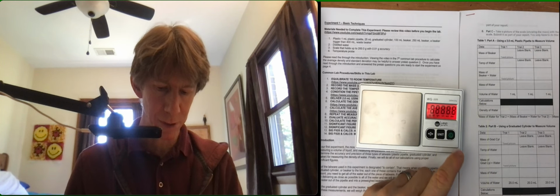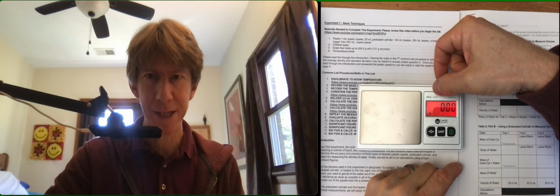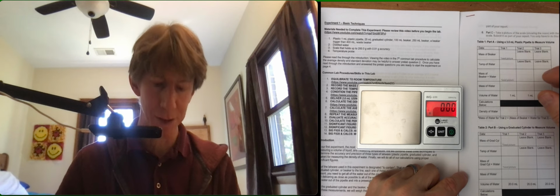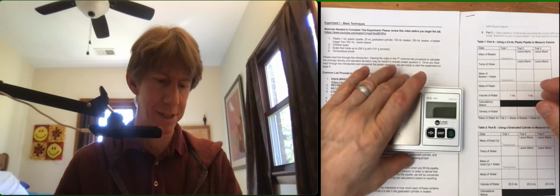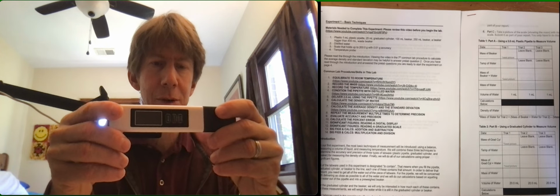A scale that holds up to 200 grams with 0.01 gram accuracy. This is the 220, I don't know if you can see that number there. And then it does go to the 0.01 gram. Perfect. And a temperature probe. My temperature probe looks like this. Yours may look the same or different.